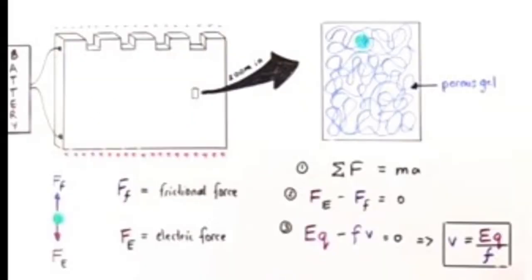Here is just a brief diagrammatic presentation of how electrophoresis works. Imagine this is the diagram. I'll briefly try to explain how it is being done.